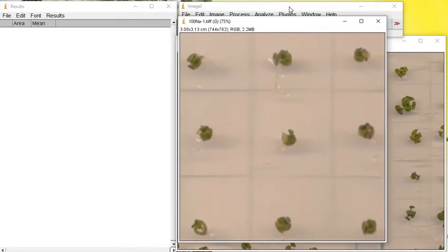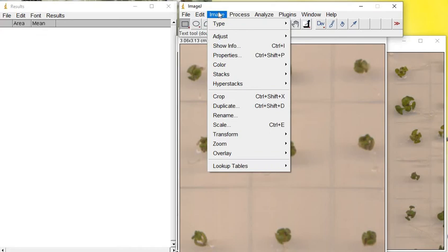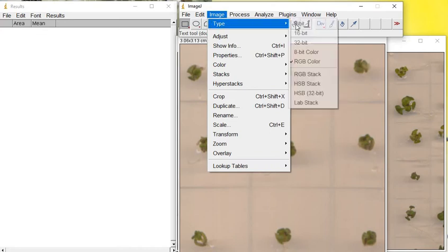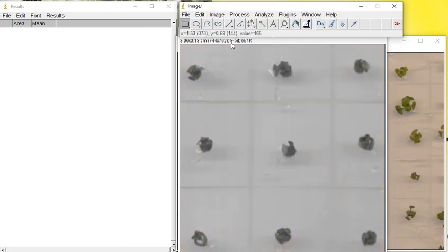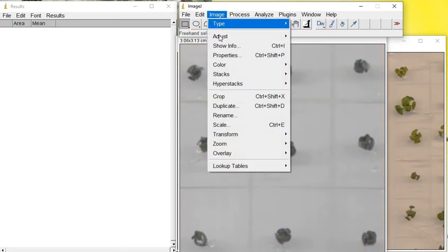Now we need to convert this image into 8-bit for further analysis, then go to Image, Adjust Threshold.